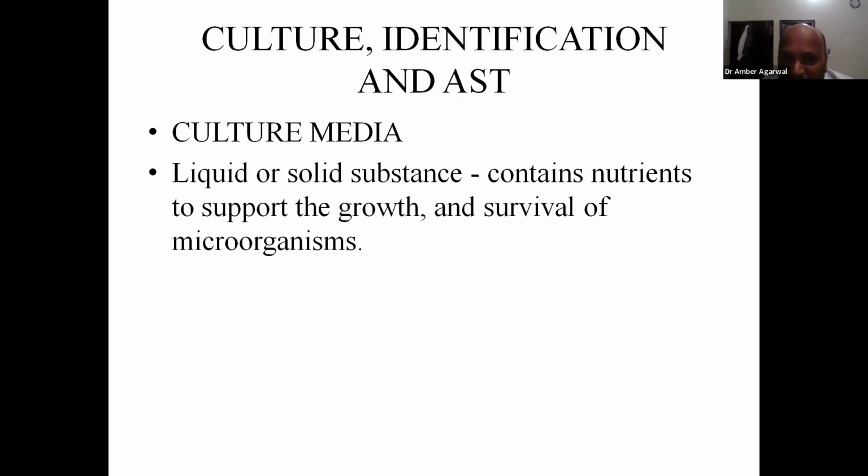Now, culture media are liquid and solid. Most commonly used medias are solid. Liquid medias are generally used as transport media, and in the lab for inoculation, like peptone water and your BHI.